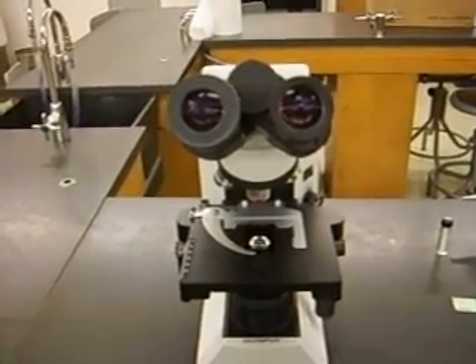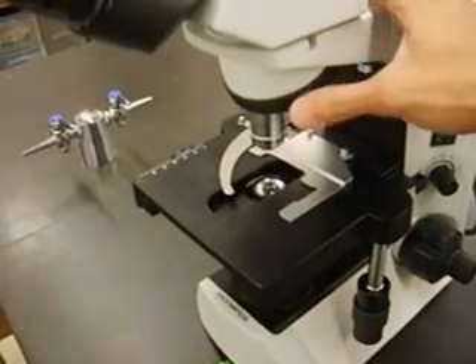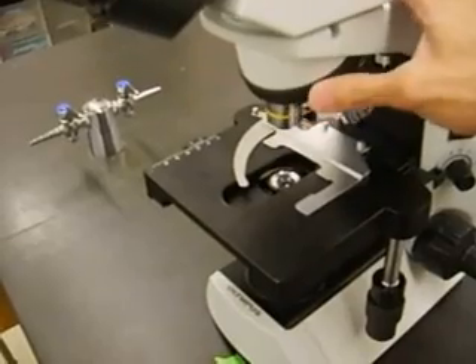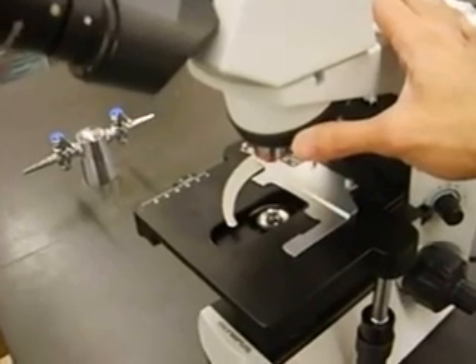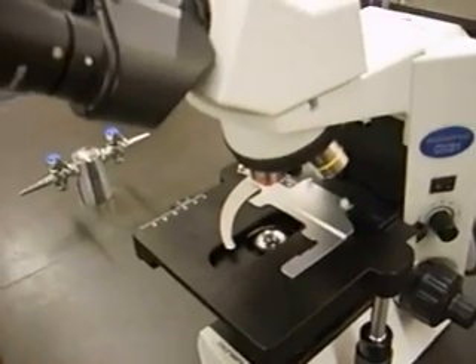Another thing you're going to be manipulating a lot this quarter is the objective lenses. We have four objective lenses on our microscopes. One of them actually requires a drop of oil in order to look through it correctly and get it into focus, and we'll show you more about that later.